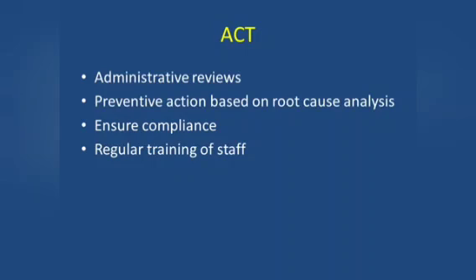Act. There should be administrative reviews to look at what's going on in the laboratory. There should be preventive action based on root cause analysis. There should be measures put in place to ensure compliance by the staff. And there should be regular training of staff, especially since there is a turnover of staff in the department.